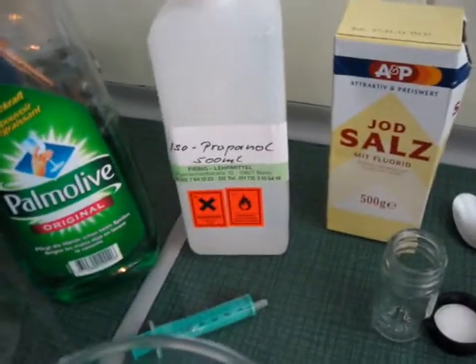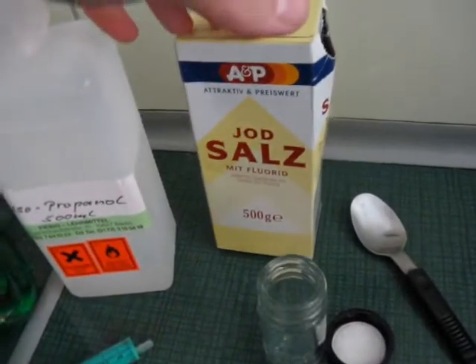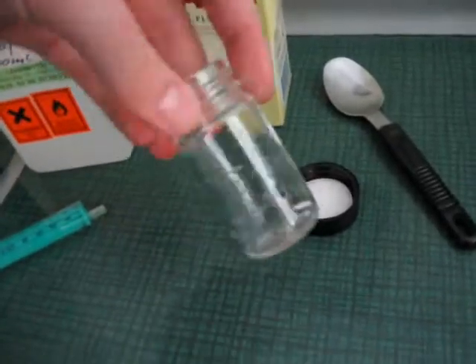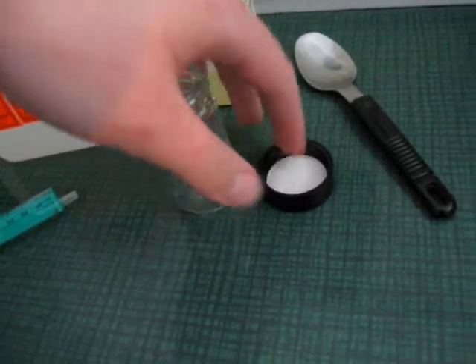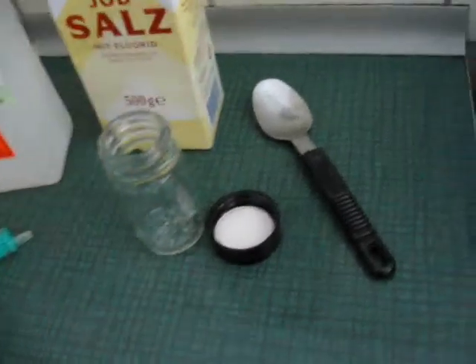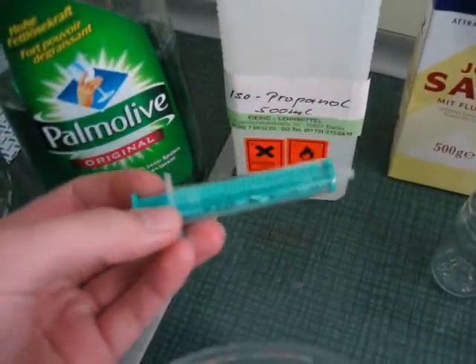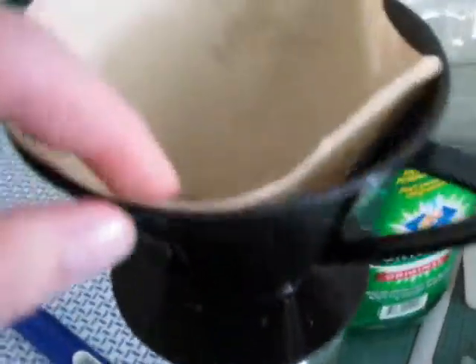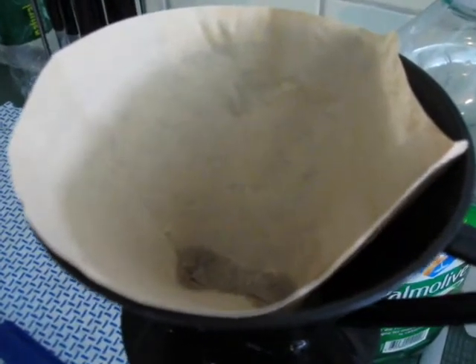You will also need isopropanol, which you can get at any pharmacy, and sodium chloride, which is just normal table salt. Then a small glass vial or something with a tight lid. You will need a tablespoon and ideally a syringe to measure things. Also you will need filtering equipment, which can just be a normal coffee filter or some kitchen paper towel.